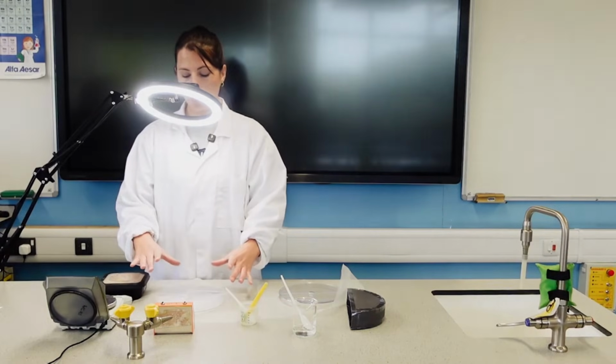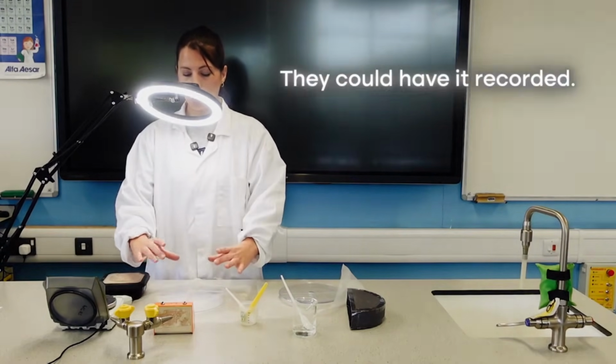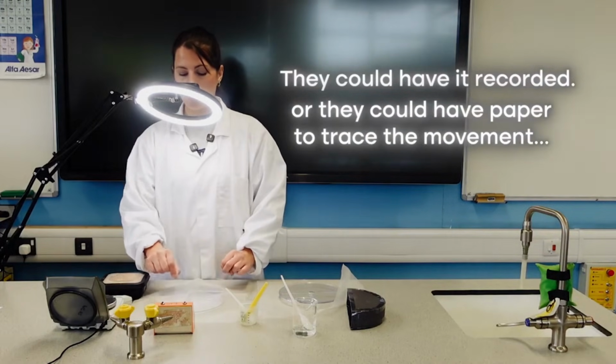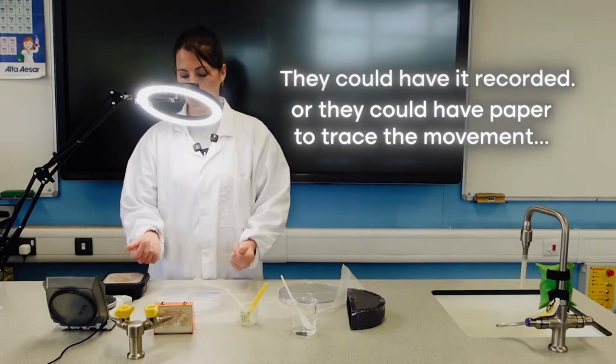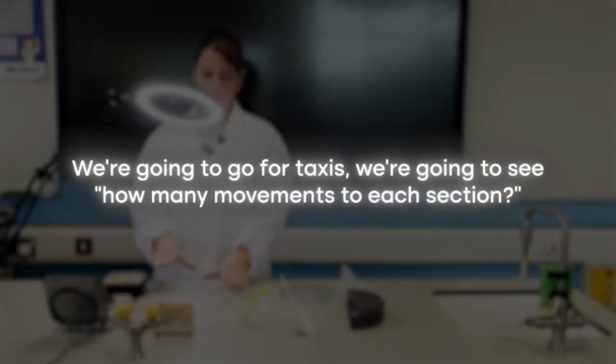But they could, if they were going to investigate kinesis instead, they could have it recorded, or they could have paper where they trace the movement of an individual maggot, so you can actually then see the movement of it. We're going to go for taxis. We're going to see how many move into each section.